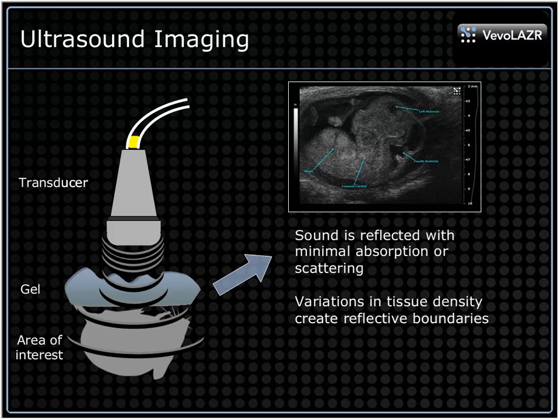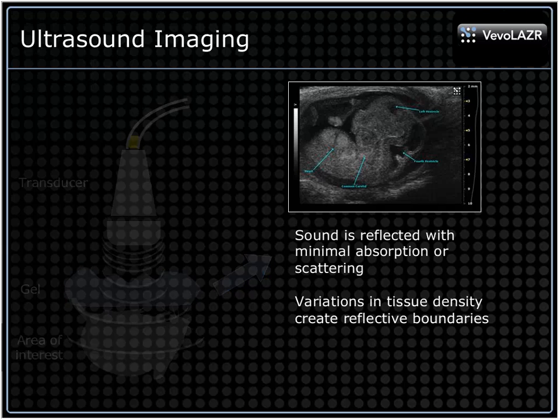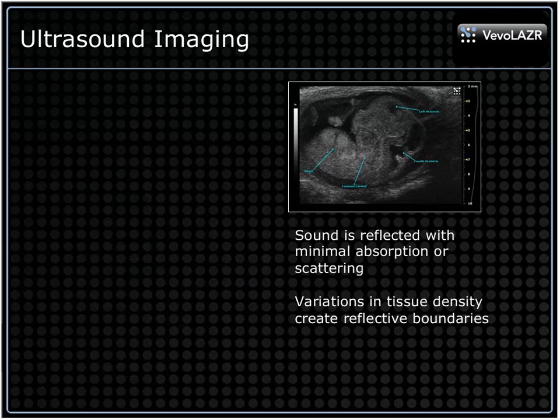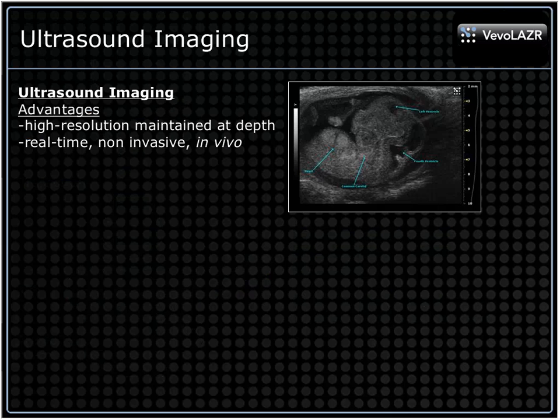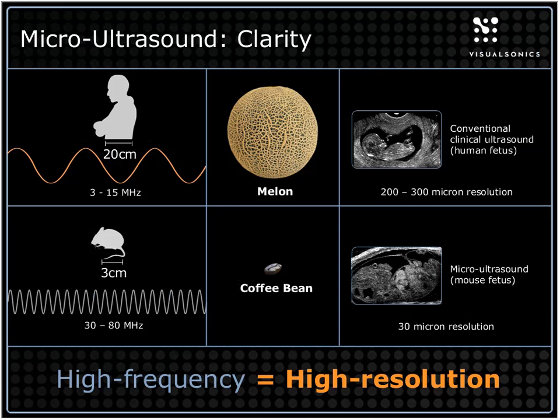freely. Now, the advantages here include things like real-time imaging. We get high resolution at depth, and I'll talk about that in the next slide. But we get this real-time, non-invasive in vivo imaging. We can have multiple imaging sessions and look at the same animal over time, as I mentioned.